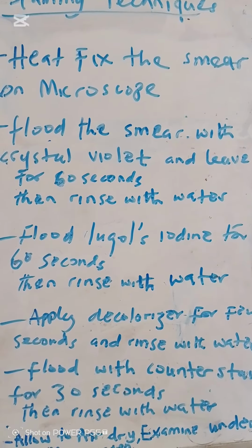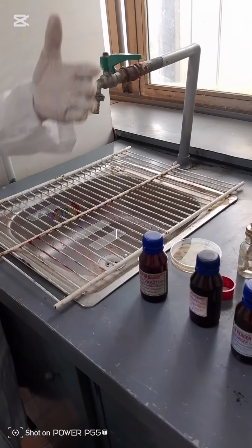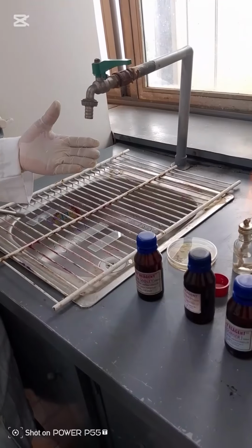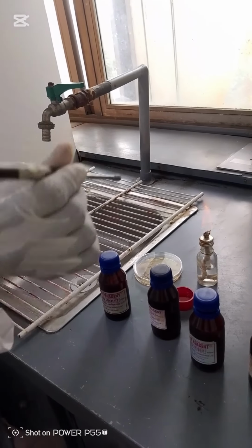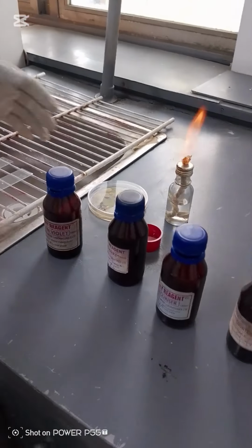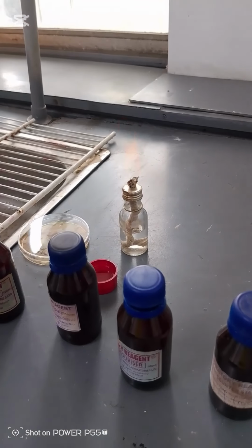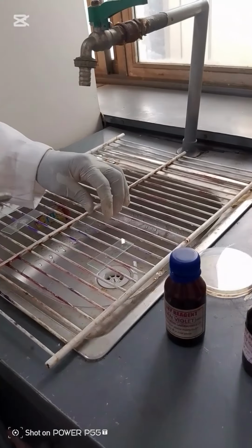Now let's go into the gram staining proper, the practical. The first thing is the materials we're using: an inoculating loop, we have our staining reagents, we have the bacterial cell, and we have our spirit lamp, and we have our glass slide.